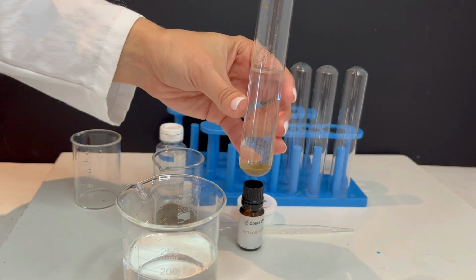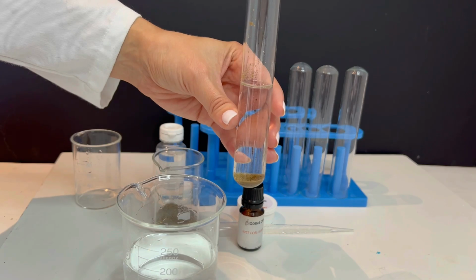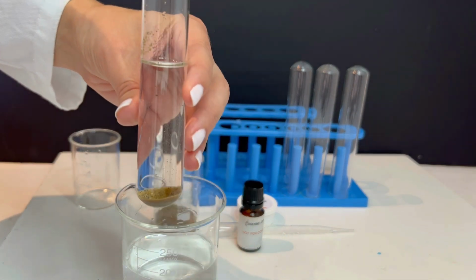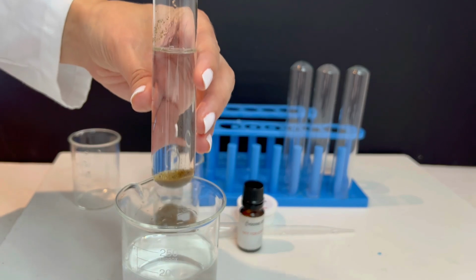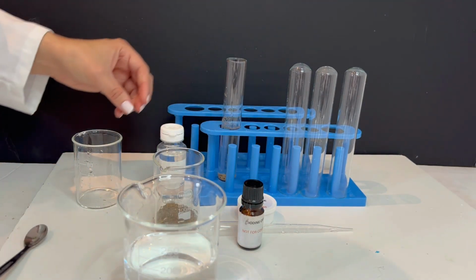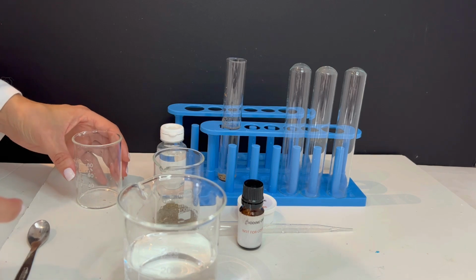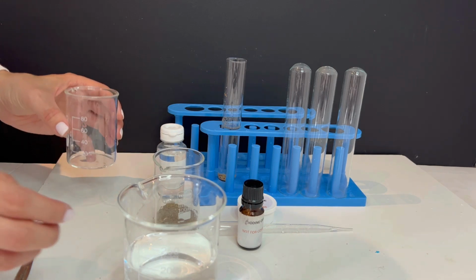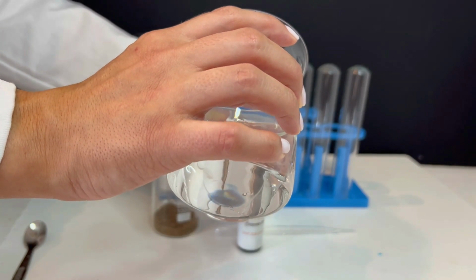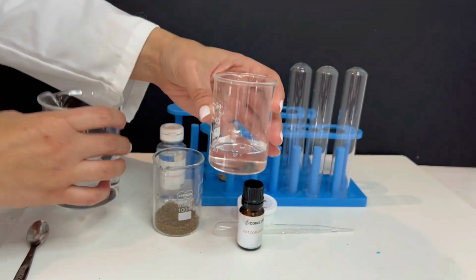Observe how the sand settles at the bottom and does not dissolve. This is a heterogeneous mixture. In the second test tube, we add about 20 milliliters of water and a spatula of copper sulphate, and then we mix it.